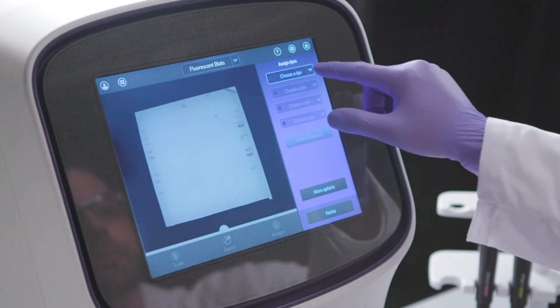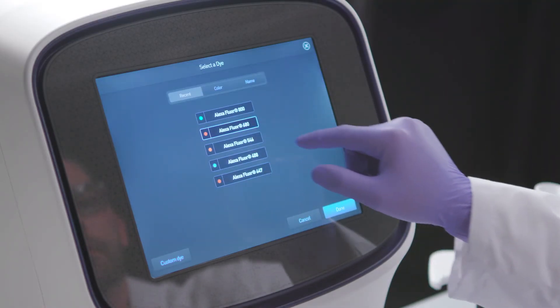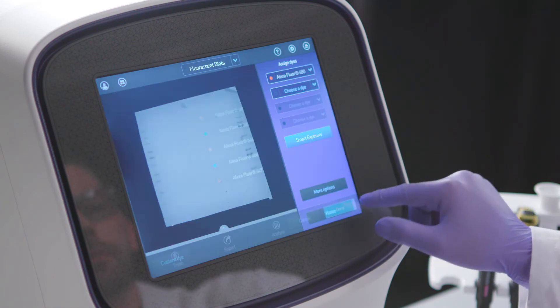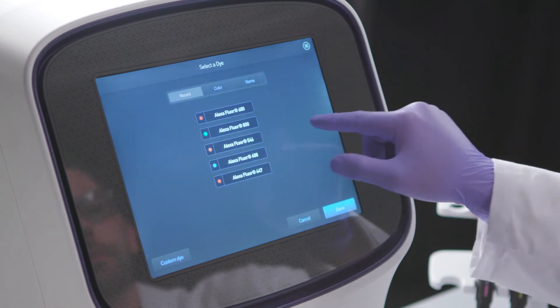Image on the Invitrogen iBright imaging system using the fluorescence detection mode. Select the Alexa Fluor 680 and 800 channels and click Smart Exposure.